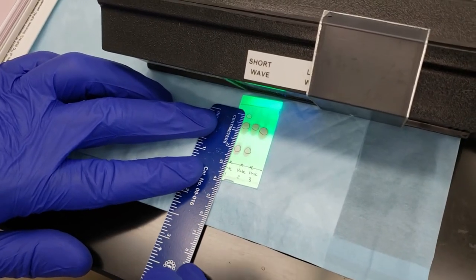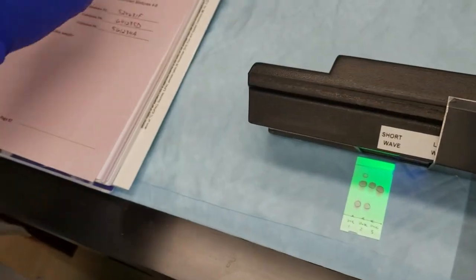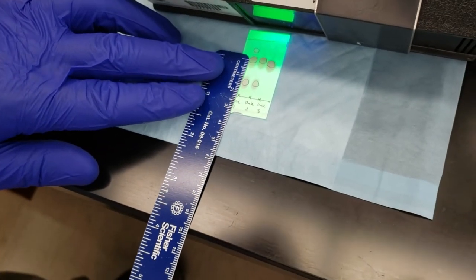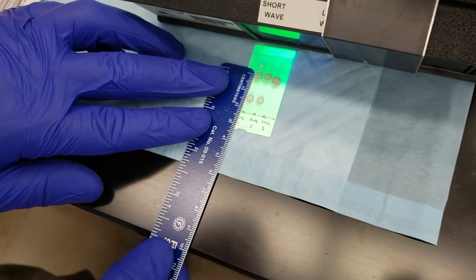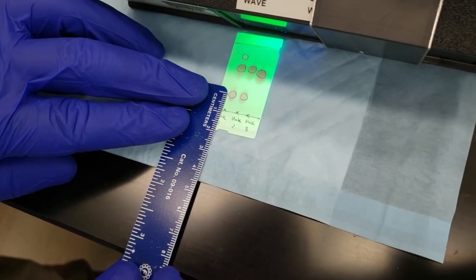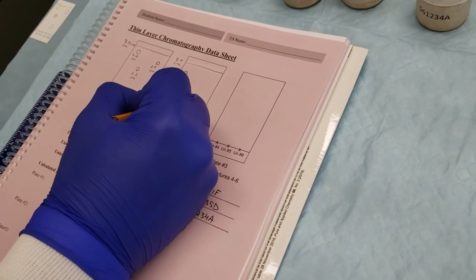Our top spot comes in right at 2.9. Our middle spot, right at 2.2. And our bottom spot at 0.9. And that's good for our three spots of unknown number one.